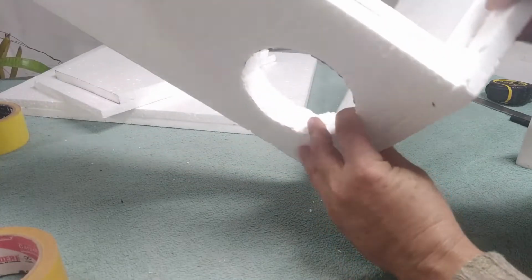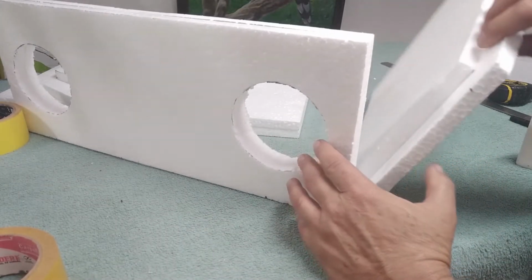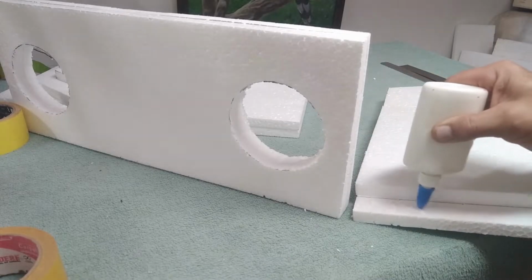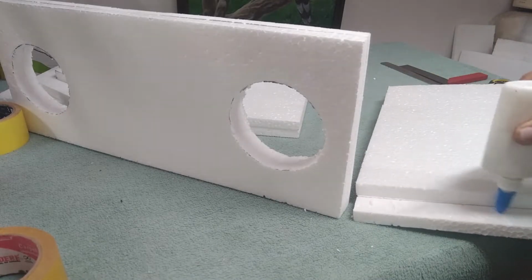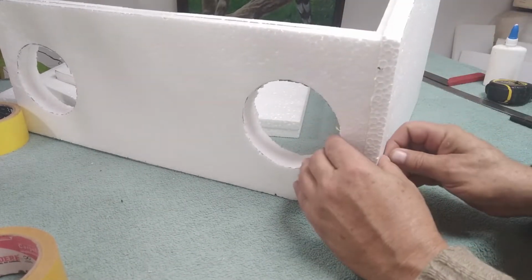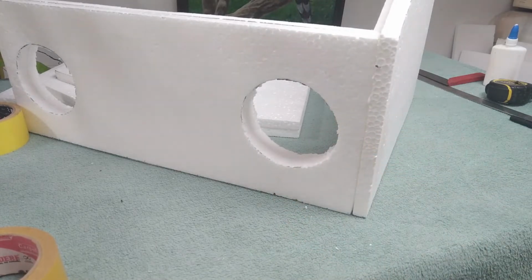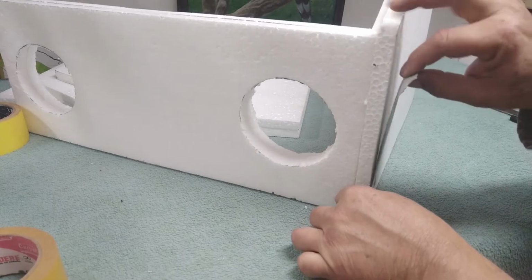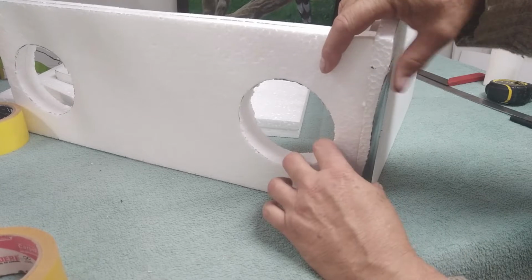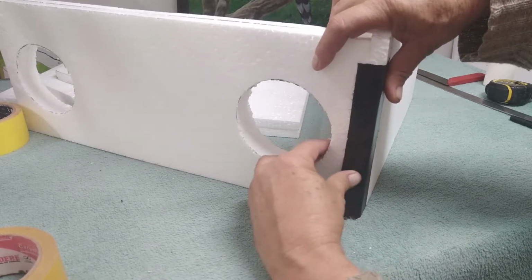So now let's begin the assembly. We're going to be using white glue and duct tape. Always press the tape tight and strong against the foam.